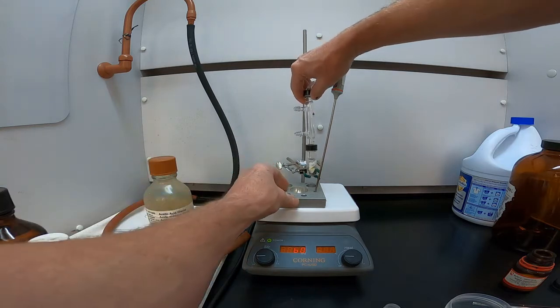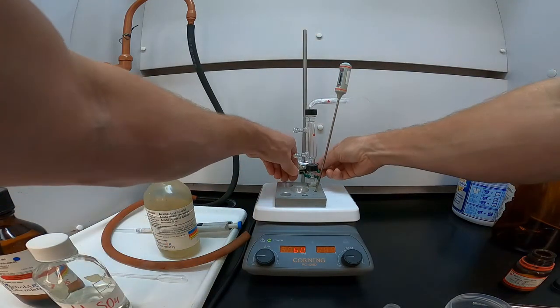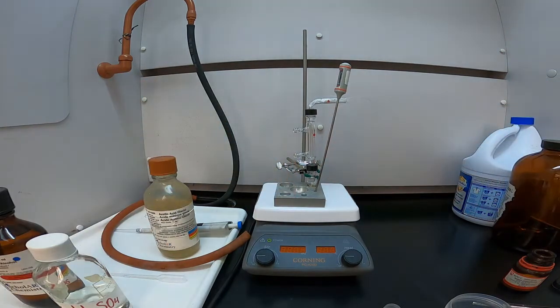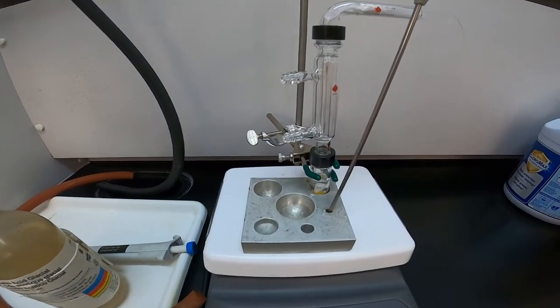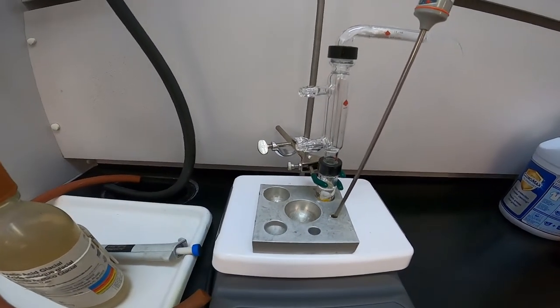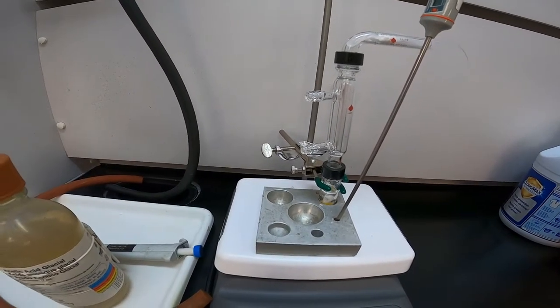I'm going to put that on my aluminum heating block and start the heating. And it's always important, with things like this, to clamp them. So I'll get in close there so you can see I have the magnetic spin vane going. It's spinning rather slowly for now, just so you can see it moving. I'll speed it up some. So we've got all of our reactants mixing.